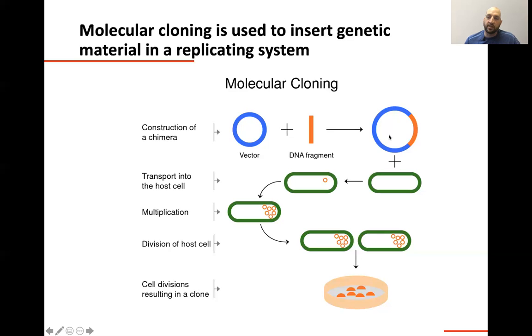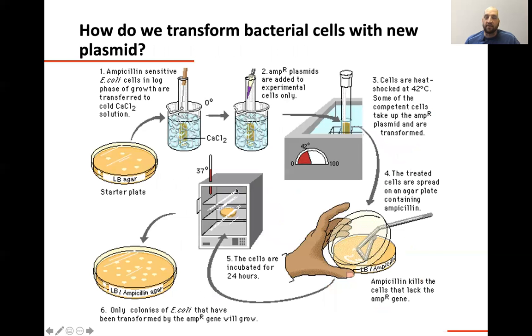So let's talk about this process. How do we get this plasmid inside of the bacterium? This is kind of an old slide. You can see it's a little bit pixelated, but I think it does a pretty good job of describing this technique, and it's an old technique. So maybe it's appropriate that we're using some old looking graphics to explain it.